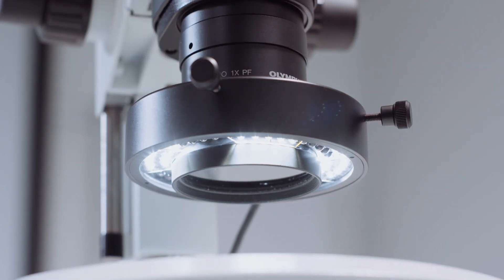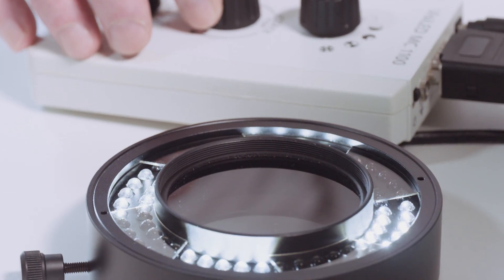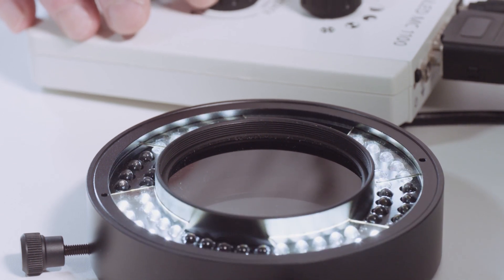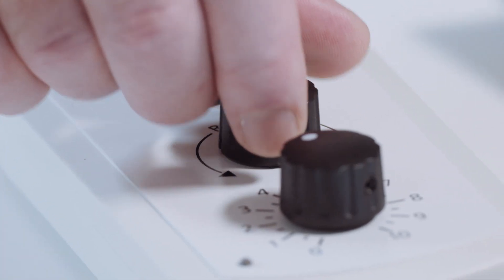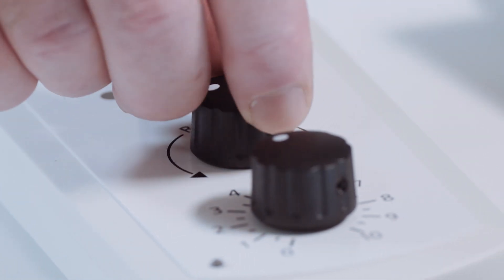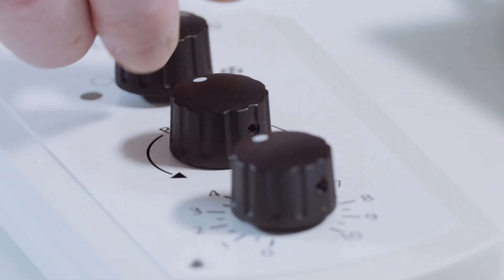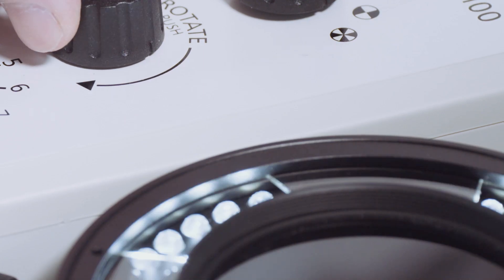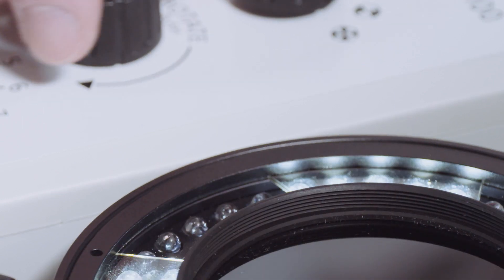The analyzer itself is mounted in cross-polarization to the polarizer. Thanks to this construction, it is now possible to switch back and forth electronically between the two illumination methods Bright Field and Polarization via a controller or a PC. There are no mechanical movements at all, which enables extremely fast switching processes and significantly improves reproducibility.